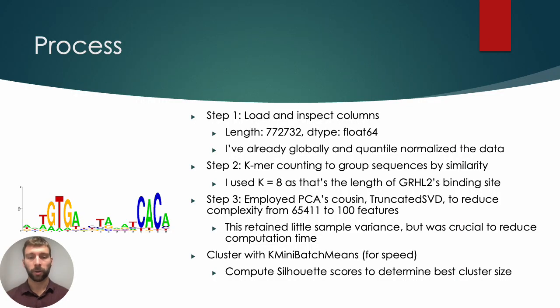So now on to my process. Separately, before this project, I had already globally and quantile normalized my raw microarray data. So first, all I had to do was load and inspect the columns, look at the data type and the number of rows I was working with.